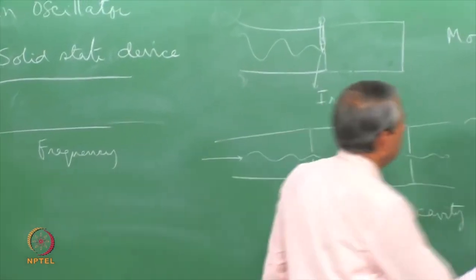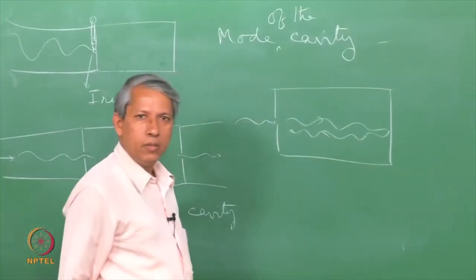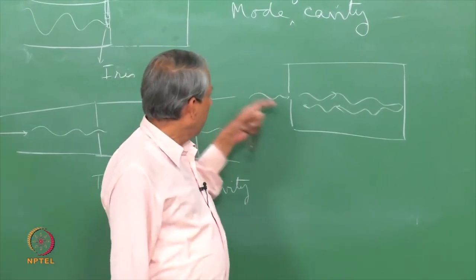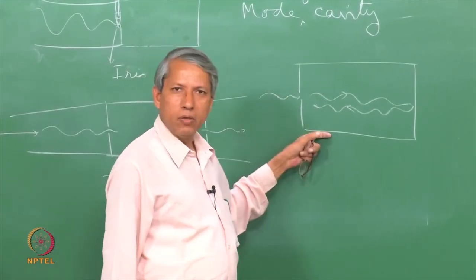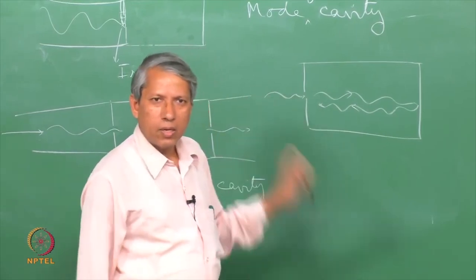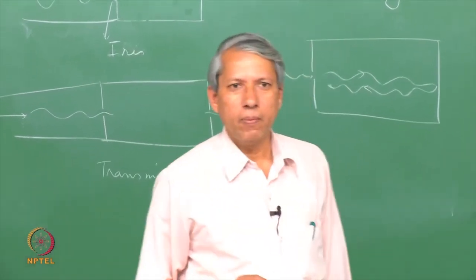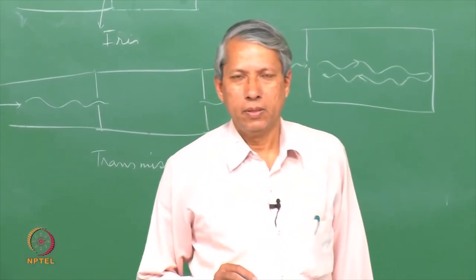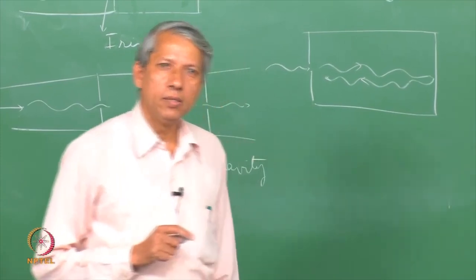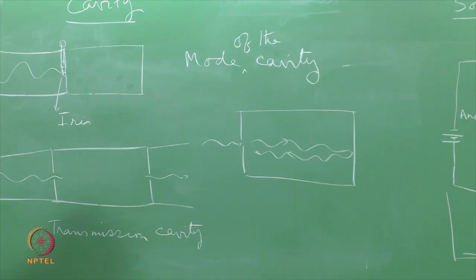So, both for a rectangular cavity or a cylindrical cavity, only one particular frequency can form the standing wave inside. Therefore, it cannot have a variable frequency EPR experiment. In fact, this is the single most important reason why EPR spectrometers are always constructed to work in a fixed frequency mode. This is the reason.